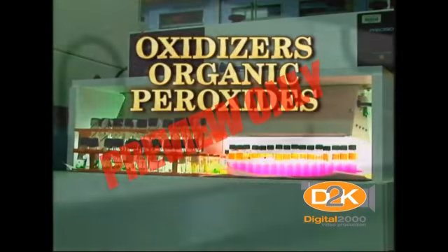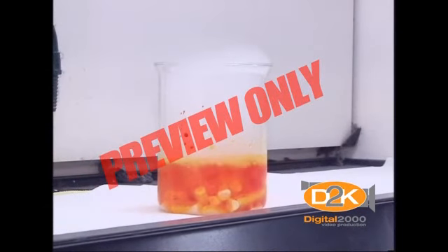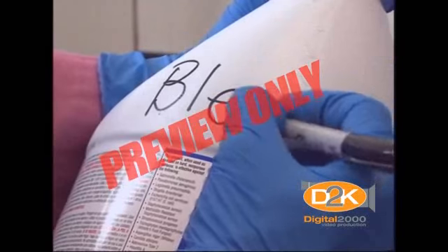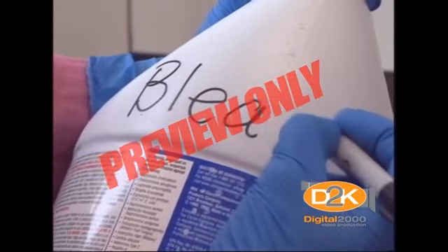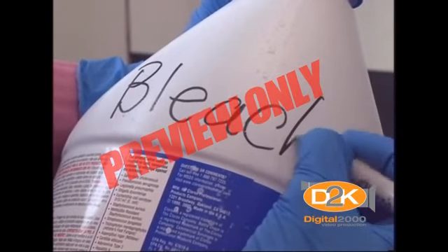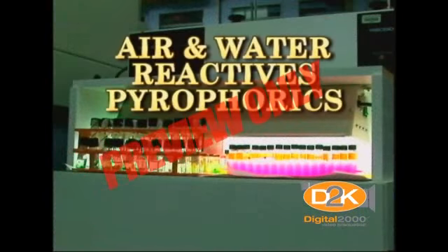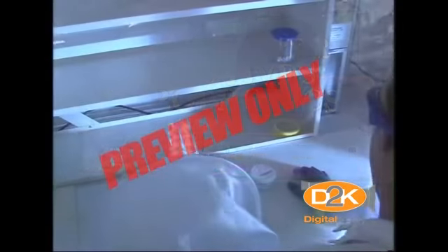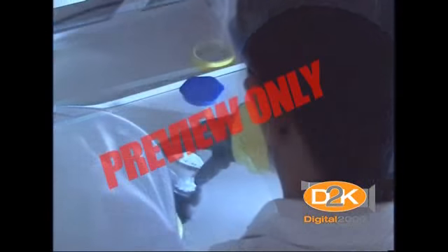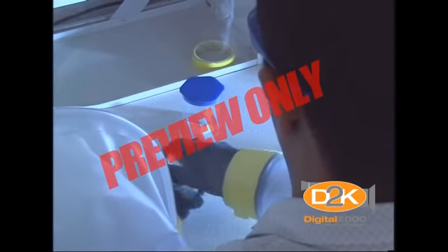Oxidizers and organic peroxides. These materials release oxygen readily to stimulate the combustion of organic matter. Examples are potassium permanganate, concentrated nitric acid, bleach, concentrated hydrogen peroxide, and urea hydrogen peroxide. Air and water reactives and pyrophorics. These materials react violently with air or water. Examples include sodium metal, magnesium metal, and zinc dust.